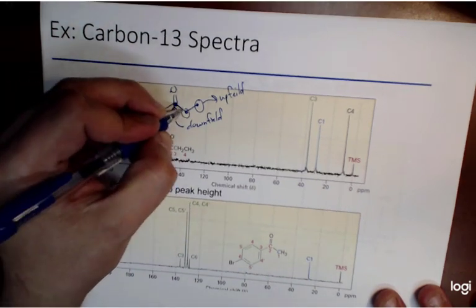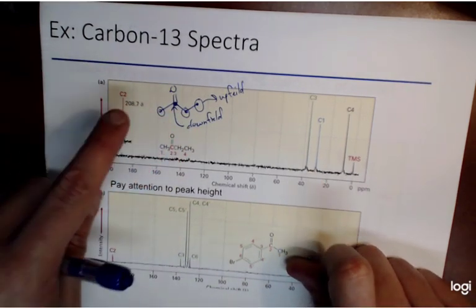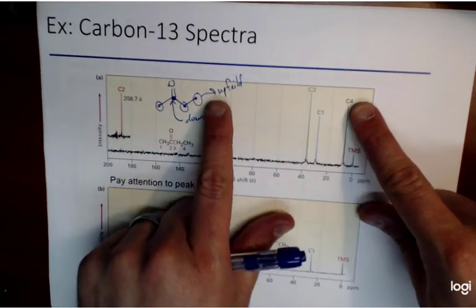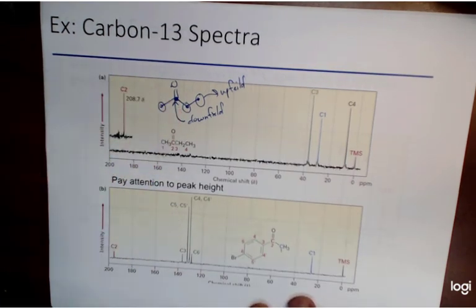These two right here are very close to that carbonyl oxygen, so these two signals would be close to one another. So C1, C3, while C4 is the one that's the most upfield. And yet again, carbonyl carbon signals are usually around 200 somewhere.